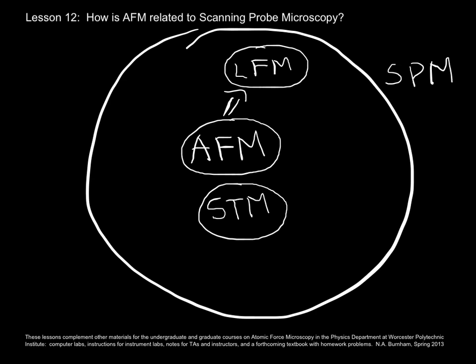And there are lots of different data acquisition modes of atomic force microscopy itself. So I'll save those names for later. Three additional acronyms today is probably enough. For SPM in general, how would one think about the instrumentation? That's what we'll do next.